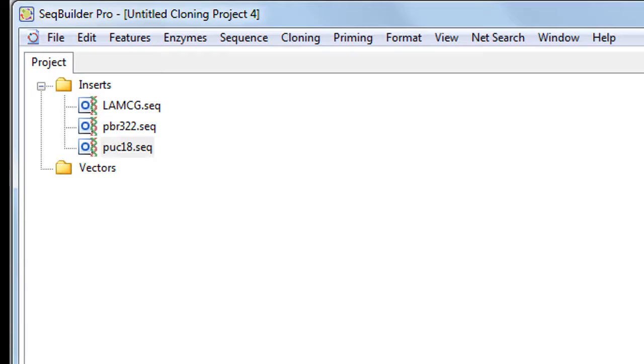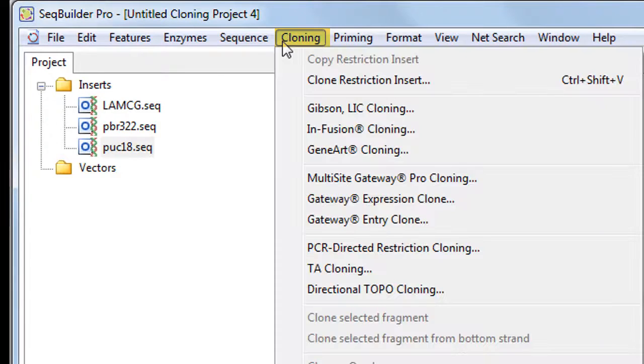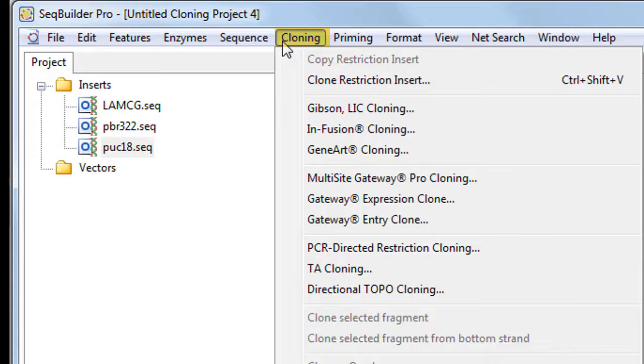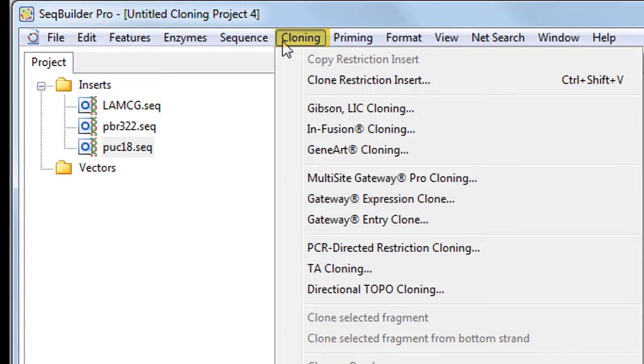Next, select the cloning method you wish to use from the cloning menu. SeqBuilder offers several cloning methods, including Gibson, Infusion, GeneArt, Gateway Multisite, TA, TOPO, and Restriction Enzyme Cloning.